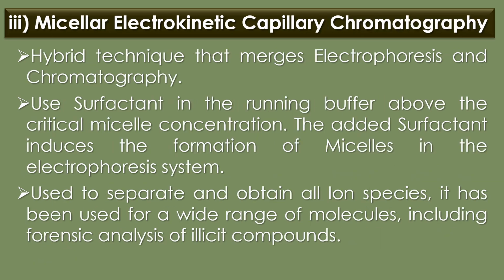The third type of capillary electrophoresis is micellar electrokinetic capillary chromatography. It is a hybrid technique that merges electrophoresis and chromatography. It uses a surfactant in the running buffer above the critical micelle concentration. The added surfactant induces the formation of micelles in the electrophoresis system.